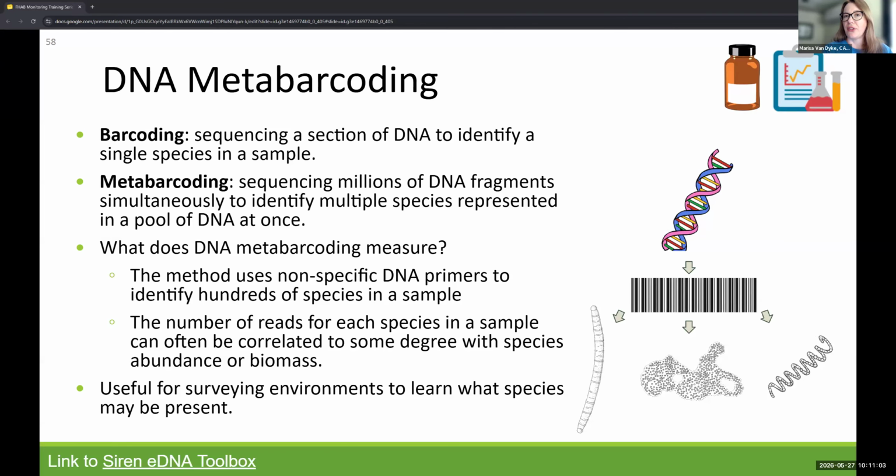This is sometimes slower to get results, just for an economical approach, because you can batch a bunch of samples, like 20 to 30 samples in one run. And if you want to batch that many samples, then you would want to wait until later to get your results. So oftentimes these are applied in special studies or when you're sampling many sites across a water body or some adjacent waterways as well, to really understand and characterize those blooms. Again, this is genus and species related, and really specific to substitute for microscopy.